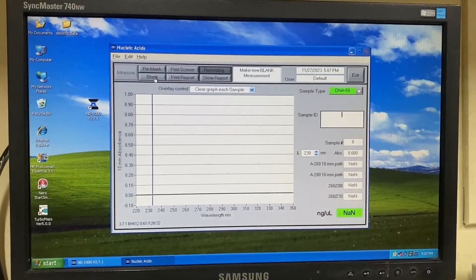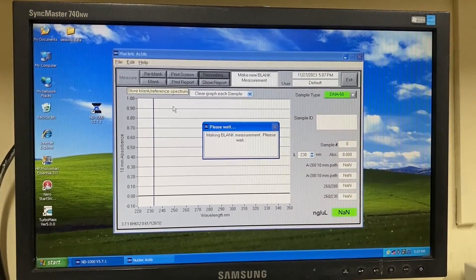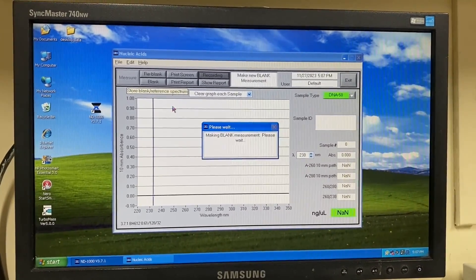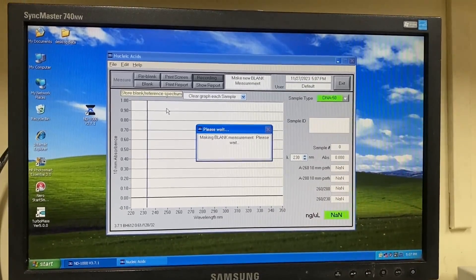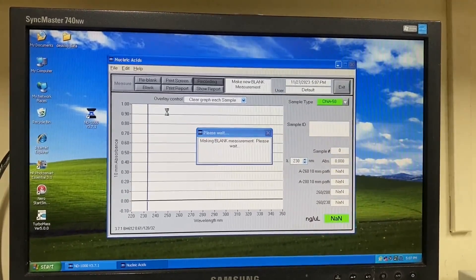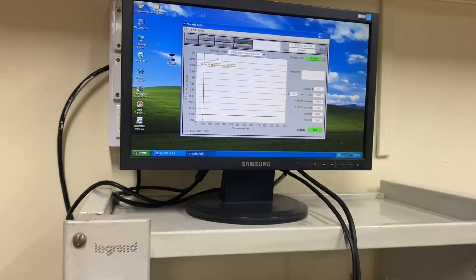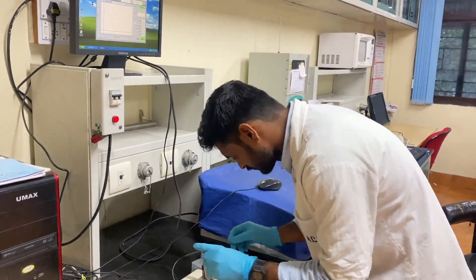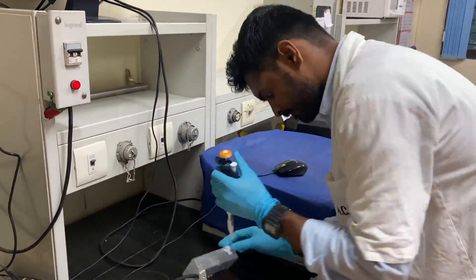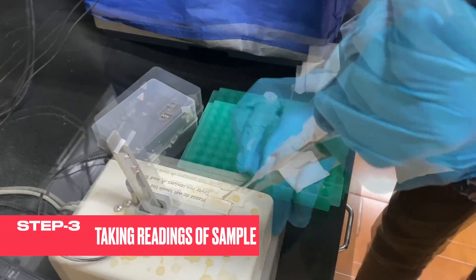Then we have to press on Blank. Now it is measuring the blank. Make sure you use the same blank — the same sterile water — that you used to dissolve your DNA, RNA, or proteins. Now the baseline has been corrected. We will load our DNA sample. Here I am going to load 1 microliter of plasmid DNA to check for its purity and concentration.